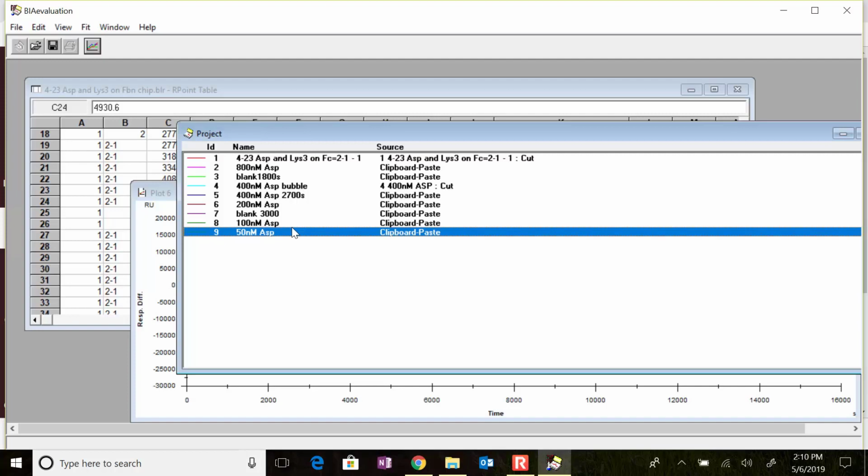Because I want the data to be literally cut out of the previous data. I have the previous data in its original form, and I can always look at that. This is always going to be processed data, so this is not changing the original data in any way. It's actually easier to keep track of where you have cut out if there's a big hole, Swiss cheese hole, right where you've already done it. So it's really to keep track of where I am.